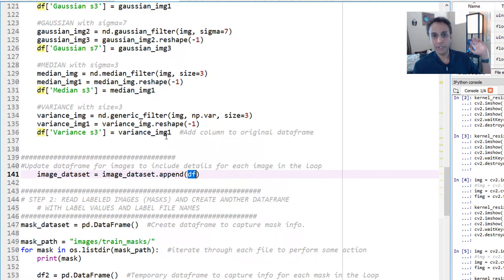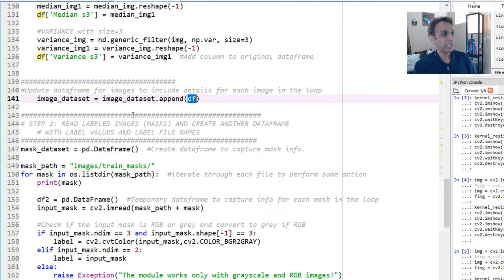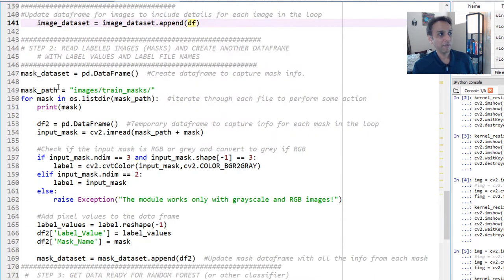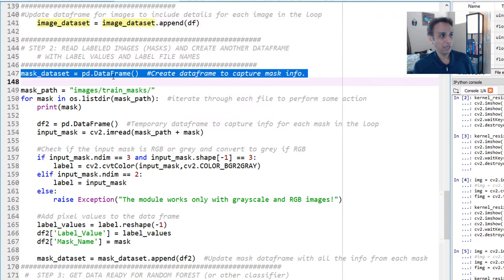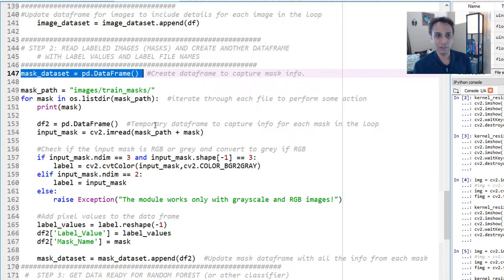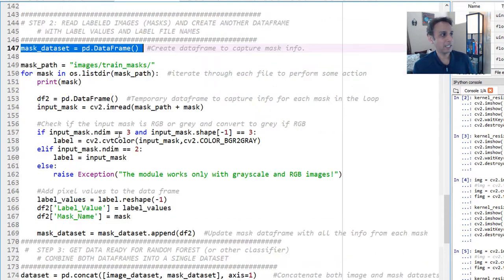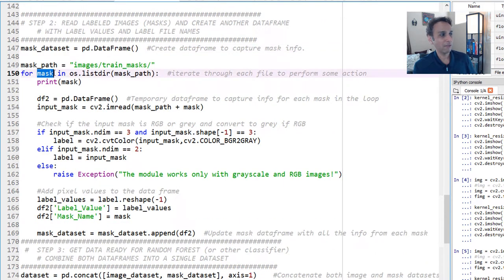So once everything is done, now remember this image data set that I have up here, the blank one that we created. So at the end of the image, at the end of all the features for image, I'm going to append the data frame that we have been accumulating for each image. That's it. This is how you do it for multiple images. So you can exit this video right now if you don't care about the rest of this part. But so I did exactly the same thing even for masks. So I created a dummy or empty data frame for mask to hold mask data set. But for mask, we are not doing a bunch of filters. What do we need for mask? The file name and the values, pixel values. That's exactly what we are doing.